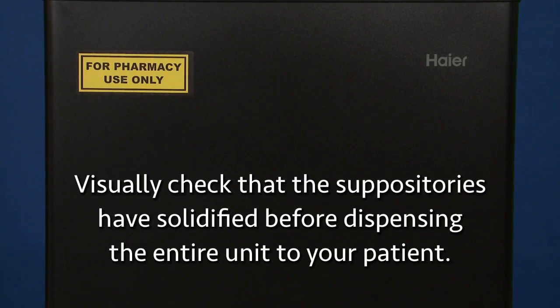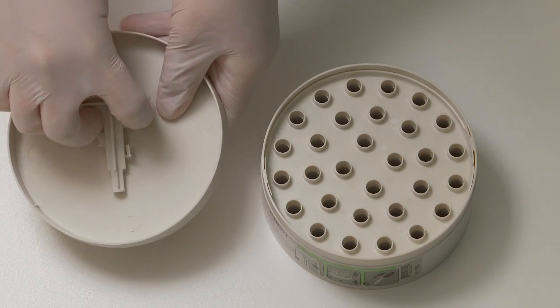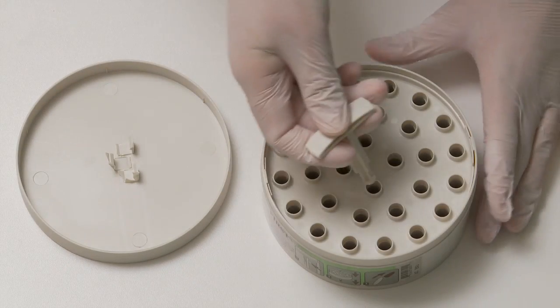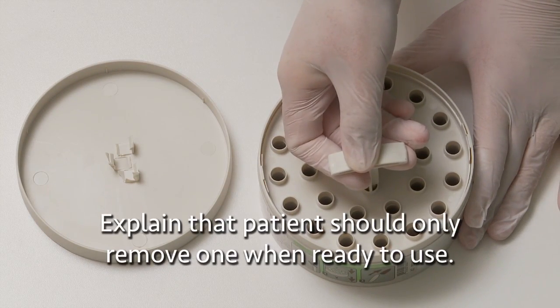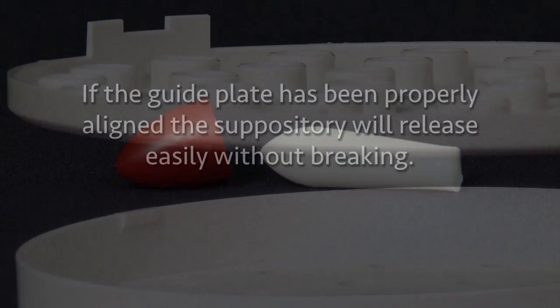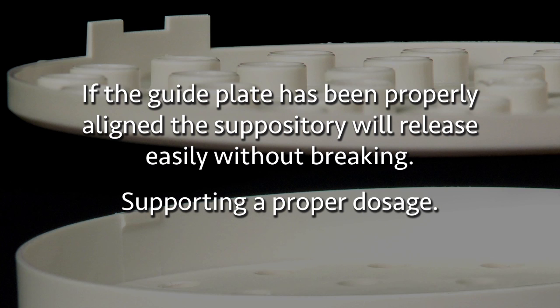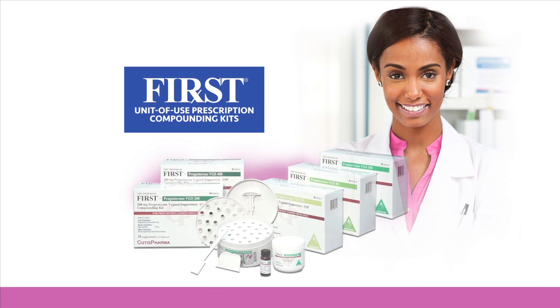Visually check that the suppositories have solidified before dispensing the entire unit to your patient. Show your patient how to use the dispensing tool, but don't actually remove a suppository. Remember to explain that she should only remove one when ready to use it. Instruct her to remove the red cap from the suppository prior to insertion. If the guide plate has been properly aligned, the suppository will release easily without breaking, supporting a proper dosage.